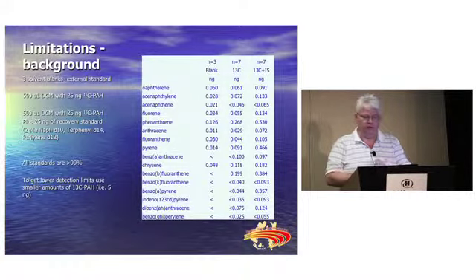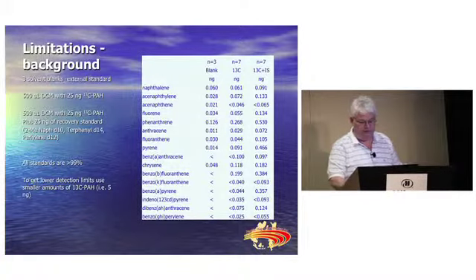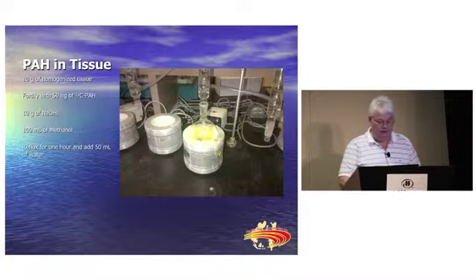So one of the solutions to get a lower detection limit here might be to lower the amount of carbon-13 we add in there, go down to a 5 nanogram solution rather than a 50 nanogram. We haven't taken it that far yet.